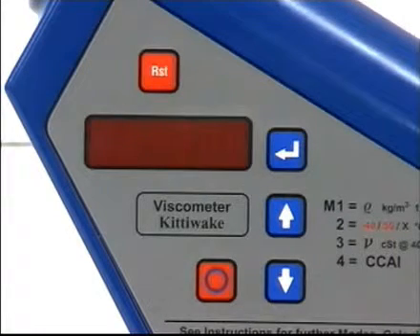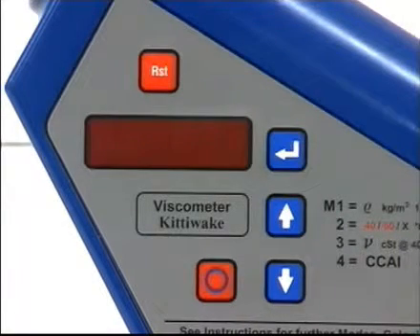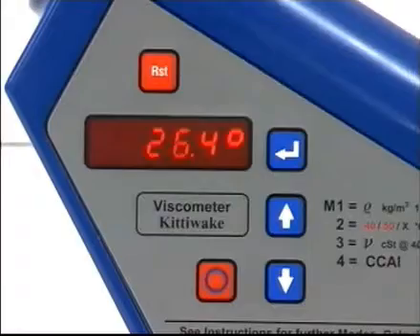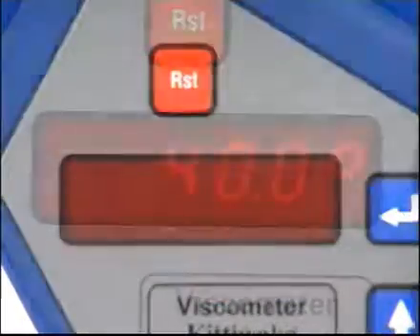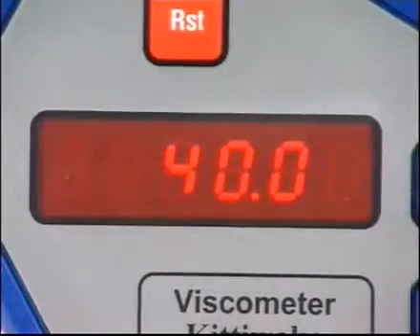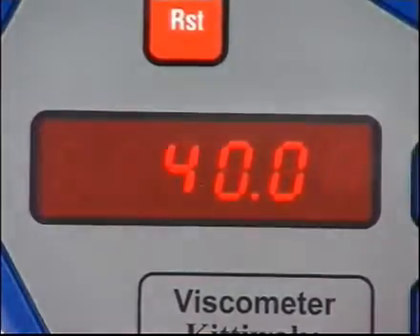Because the viscosity of oil is so dependent upon its temperature, it is very important that the temperature in the viscometer is accurately controlled and allowed to stabilize.